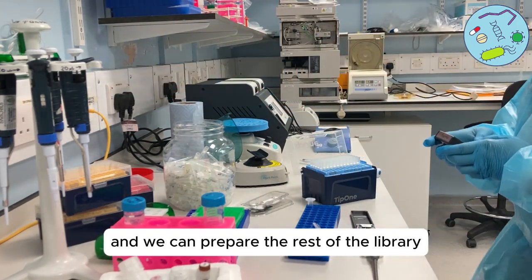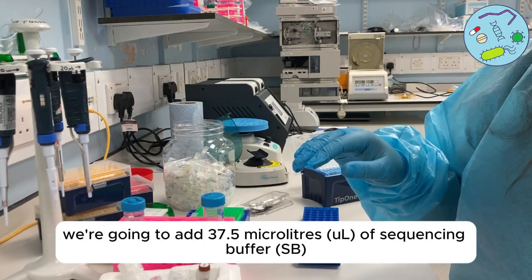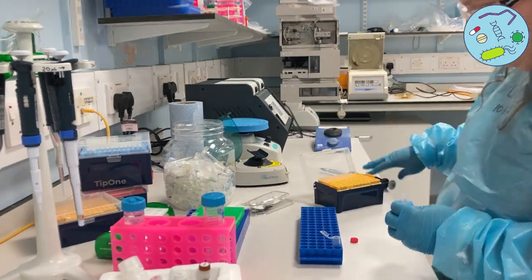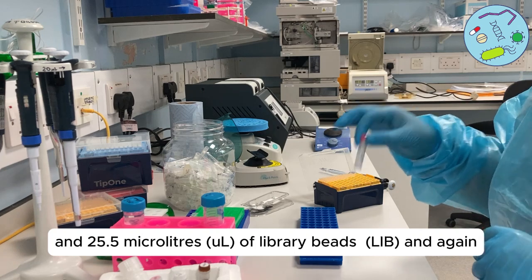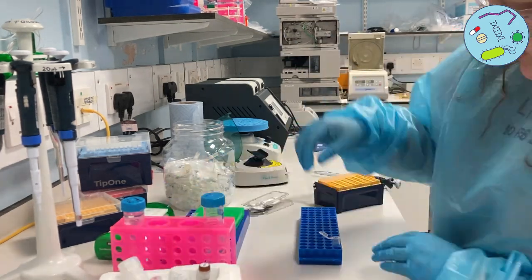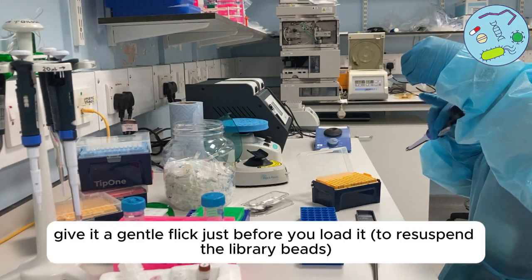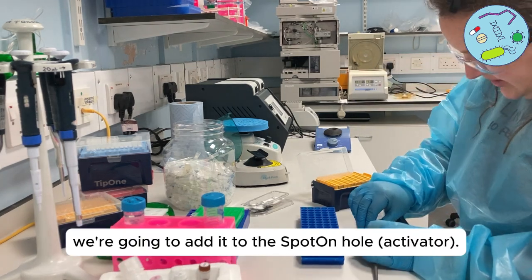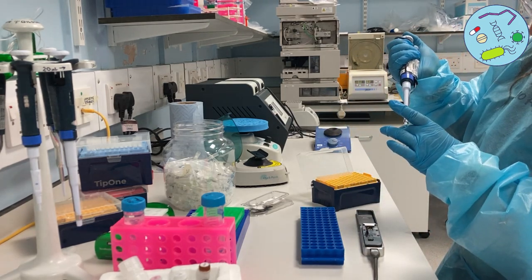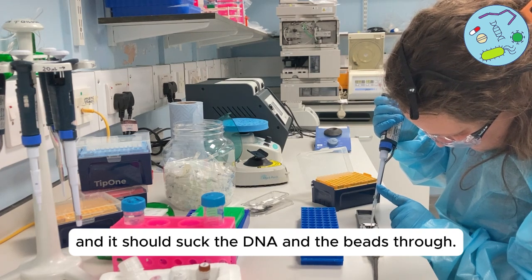Set this aside for five minutes while we prepare the rest of the library. We have 12 microliters of our DNA library. We're going to add 37.5 microliters of sequencing buffer and 25.5 microliters of library beads — make sure they're well mixed, a bit like the AMPure beads. This is your final library, what we're going to load onto the flow cell — in total 75 microliters. Give it a gentle flick just before you load it, and add it to the spot over the hole — it should suck the DNA and the beads through.